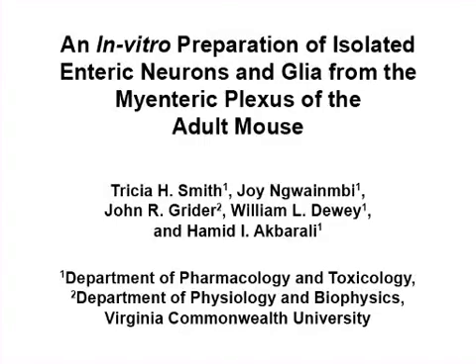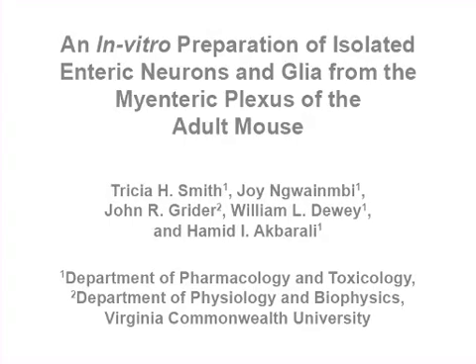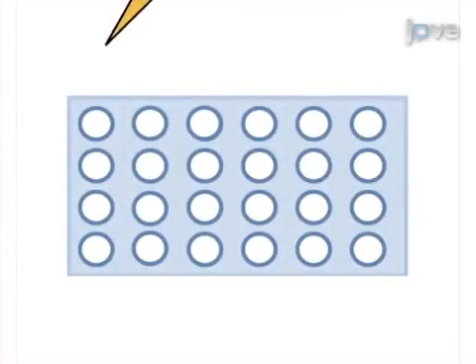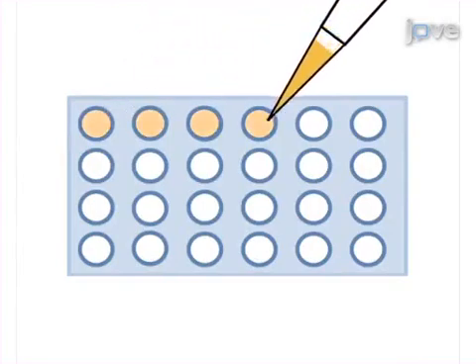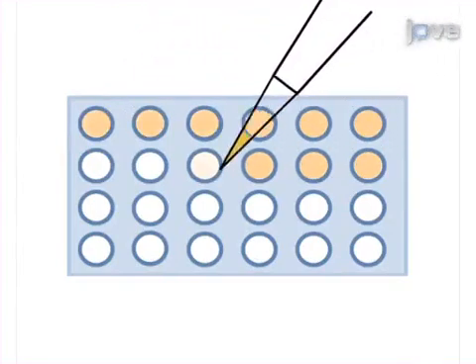The overall goal of this procedure is to isolate functionally viable neurons and glia from the adult mouse myenteric plexus. This is accomplished by first coating the sterile cell culture surface with polydelysine and laminin.